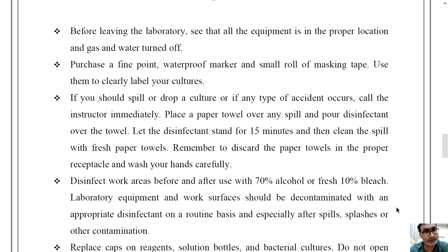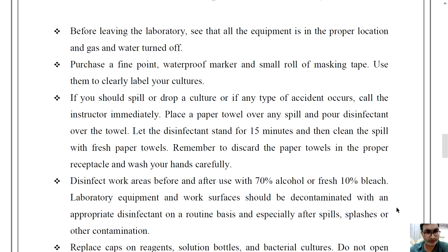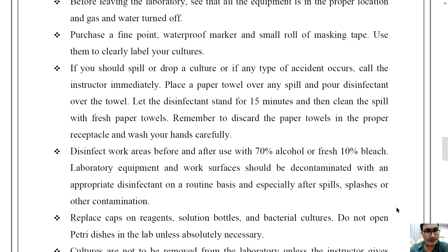Purchase a fine point waterproof marker and a small roll of masking tape. Use them to clearly label your cultures. This is very important.